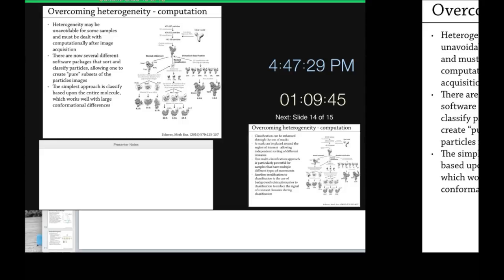And so these are things that, sample to sample and project to project, you have to be careful of. Most people just automatically do 2D classification, throw away what they call junk, 3D classification, throw away what they call junk. But different reconstruction algorithms deal with this differently. With RELION, you want to filter down to the smallest data set possible, the most pure, the cleanest data set. Other algorithms, that's not the approach they take.